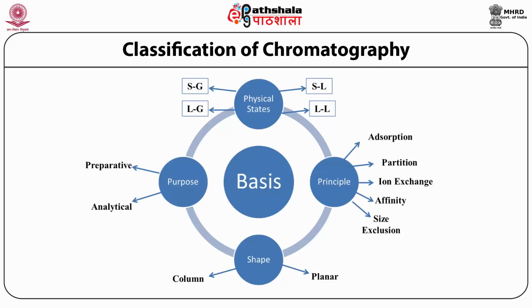In reverse phase chromatography, the stationary phase is nonpolar and mobile phase is polar in nature. In practice, this reversed phase chromatography is highly used in routine analysis, and most of the substances like drugs, etc., that are used in daily life are polar in nature.